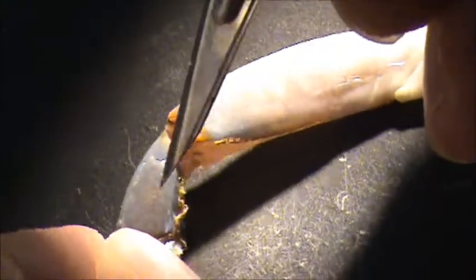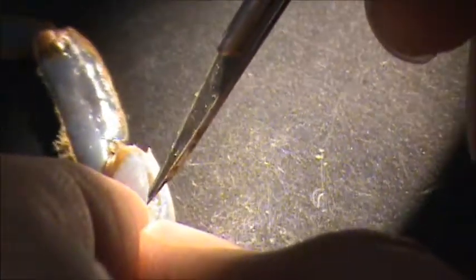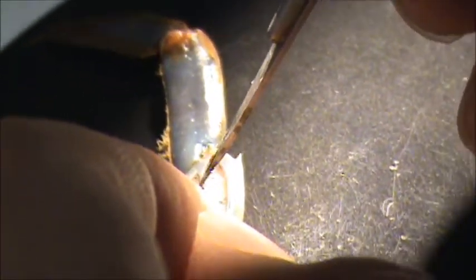Then here you should be careful when you cut it with the blade. You don't have to go too deep because you will cut the nerves, then you don't get any activities. Be sure that you cut the cuticle all the way. And you can cut the muscle like this underneath. You see that you can remove the cuticle very easily.